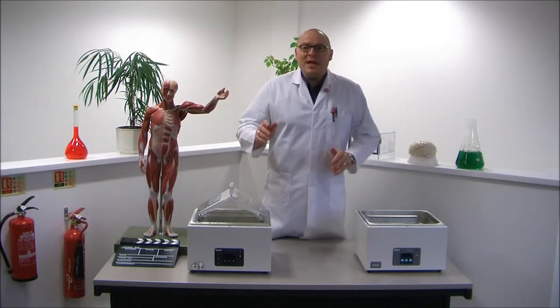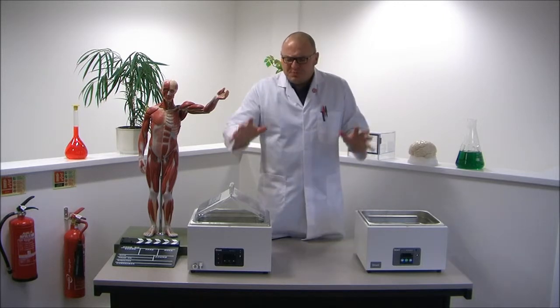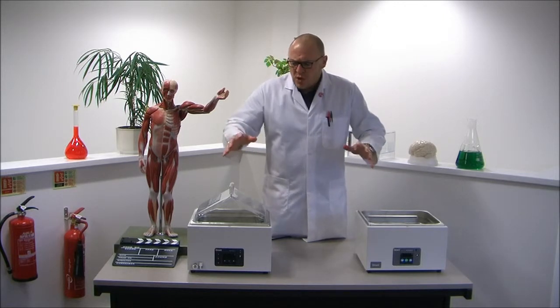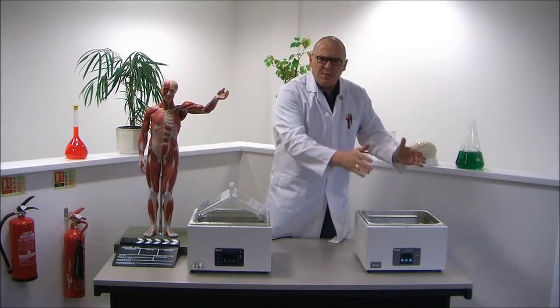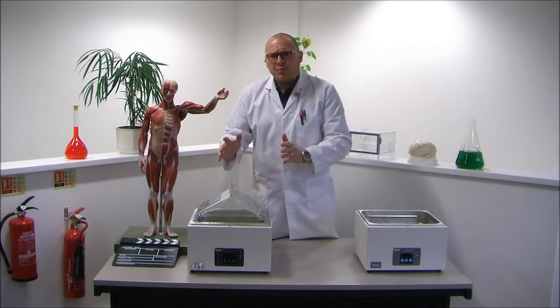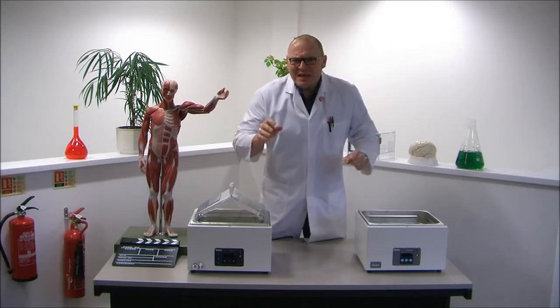Hello there. Welcome again to the Lab Warehouse. I was just busy admiring these wonderful new unstirred water baths from Grant Instruments — the JB Academy and the SubAqua Pro. Let me tell you a little bit more about them.